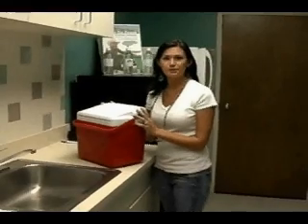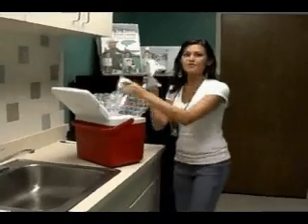Upon the arrival of an EEMT cooler to your facility, the cooler should be opened immediately, and the ice pack should be placed in the freezer.